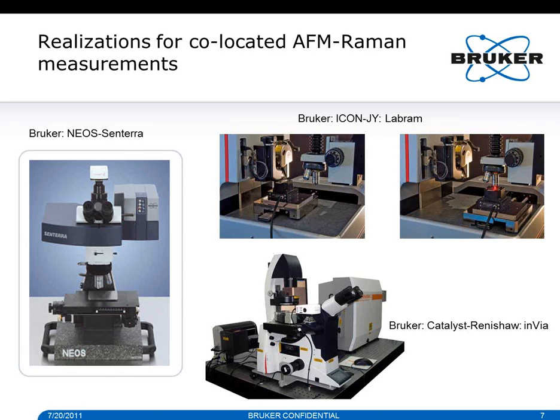So when you do these combinations, of course it's sexy to have a combined instrument, but you have to keep in mind that when you combine two instruments, that's a general statement, you have to make sure that both instruments after the combination still function close to their original specs. Meaning in a Raman microscope, you often have a lot of high-powered lasers which might be close by. So you might have to move these lasers to a different table to avoid vibrations. AFMs are very susceptible to vibrations, which somebody that does pure Raman spectroscopy might not even think about.